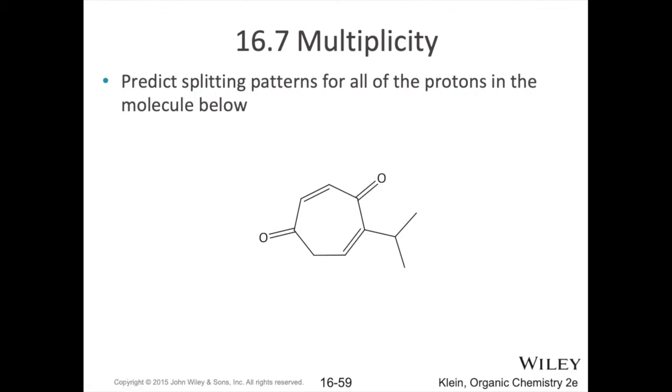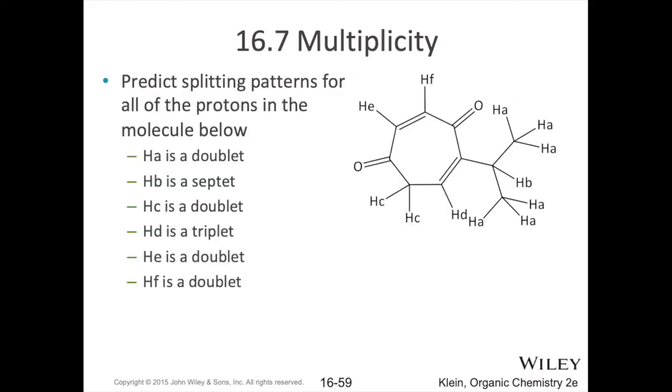So let's practice this. Go ahead and pause this video and have a look at this molecule and see if you can predict the splitting. So first of all, identify all the protons on this molecule and ask yourself, what are each of these protons going to split the others into? All right, so here we have the answers.